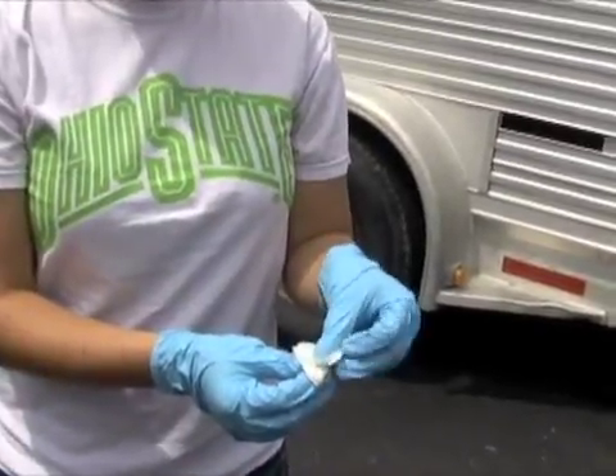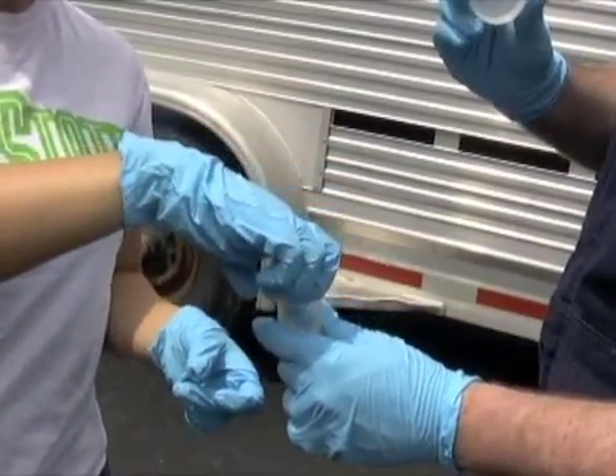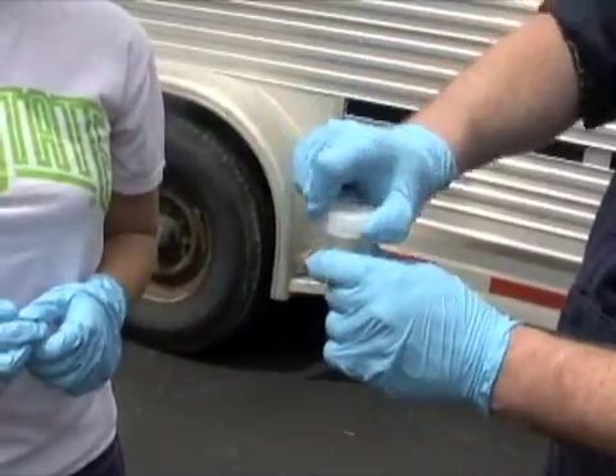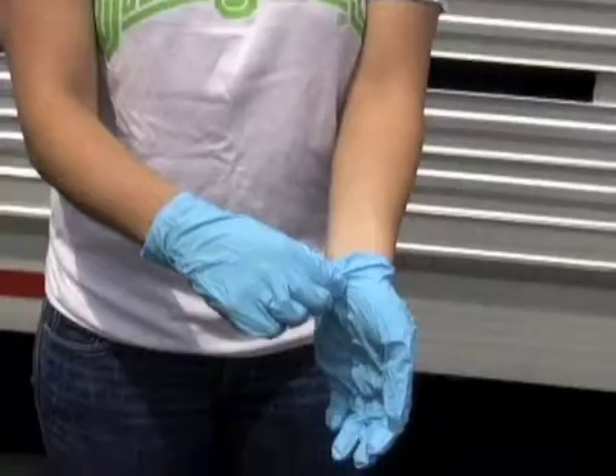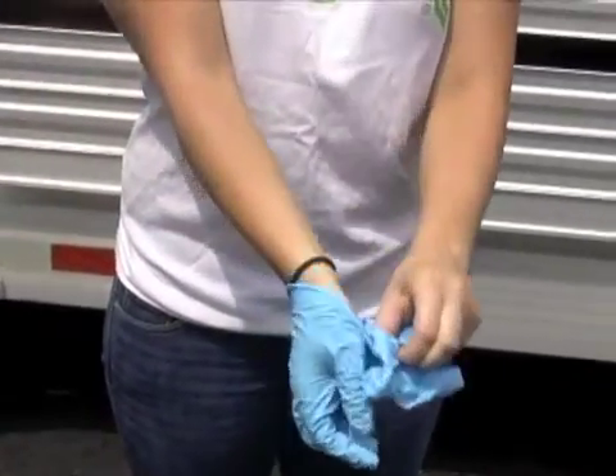After you have successfully wiped your pig's snout, fold the wipe and place it into the container provided. Remove your gloves by pulling them inside out and place them in the provided trash receptacle.